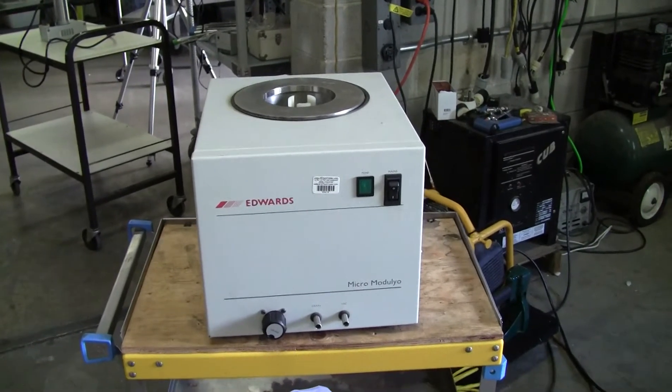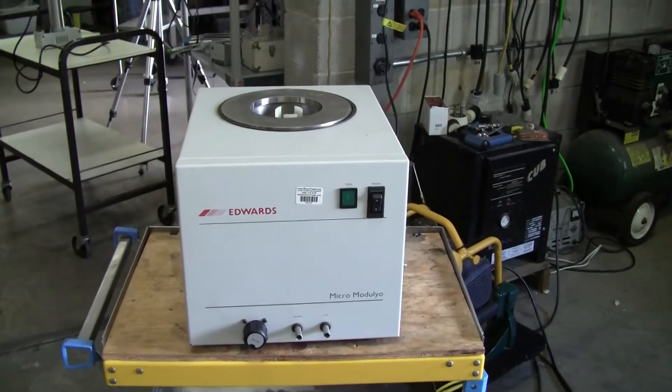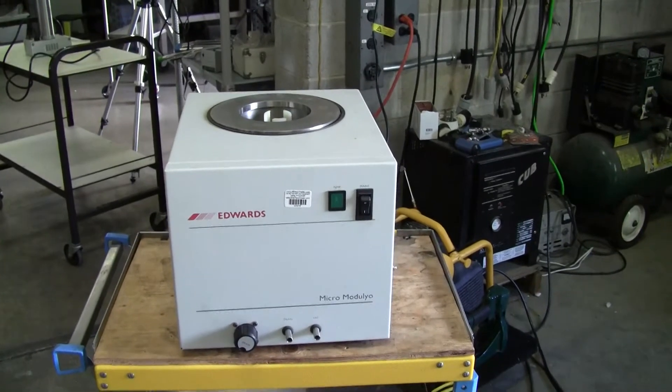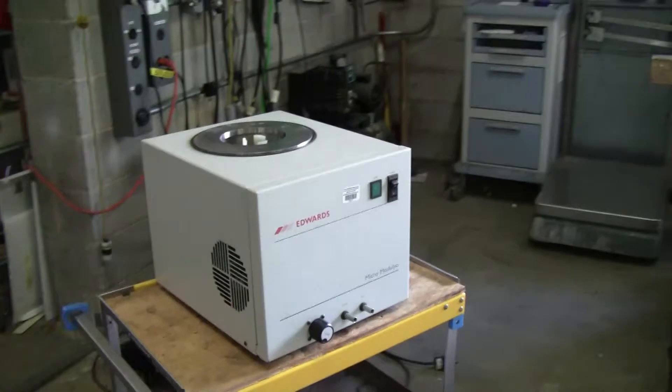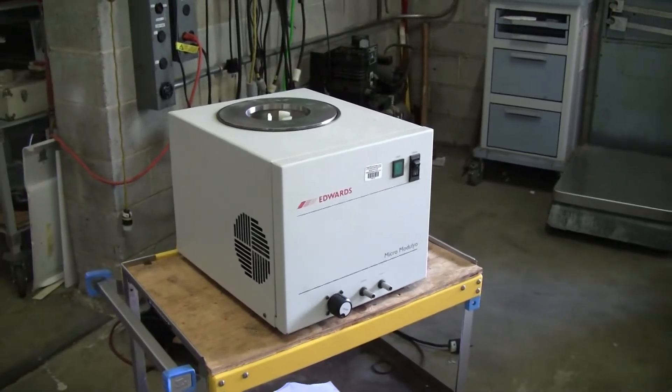Hi, this is Cody Young from Hitech Trader. Today we're looking at an Edwards Micro Modulo. This is a chiller that goes along with the freeze drying unit.